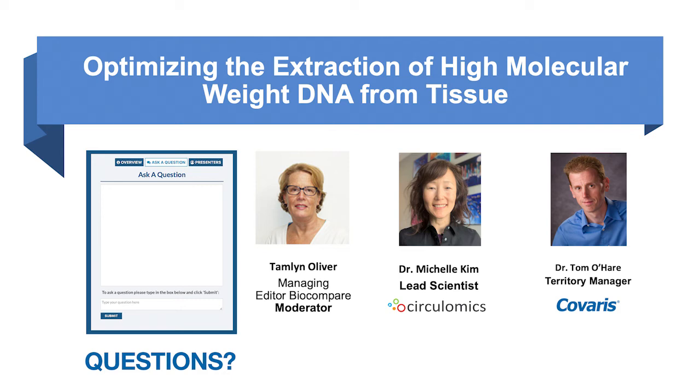Thanks, Michelle. Here's another one. Does your technology work with FFPE tissue? We are currently working on that, actually. Yes, we're working on it. The tissue part, the extraction process, is the same as our standard tissue extraction. And what we are trying to optimize now is how you get your tissue out of the paraffin, make sure you're getting all the paraffin out.